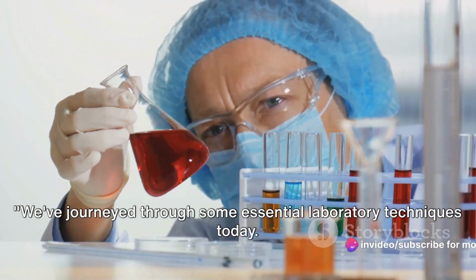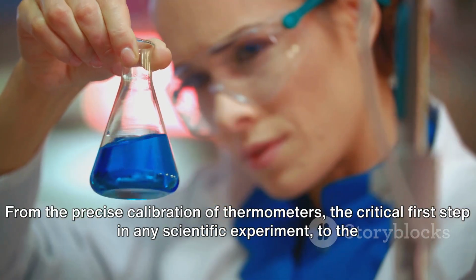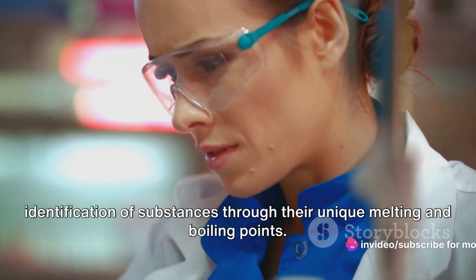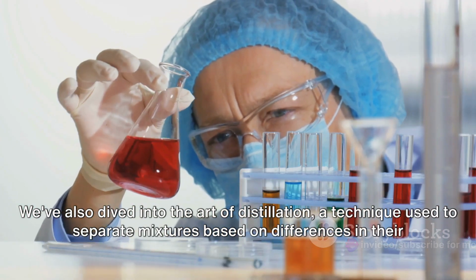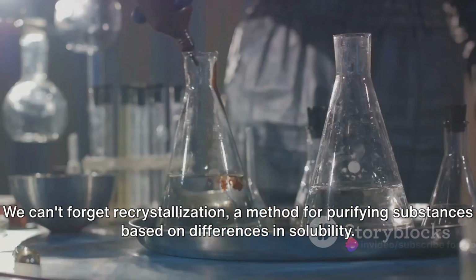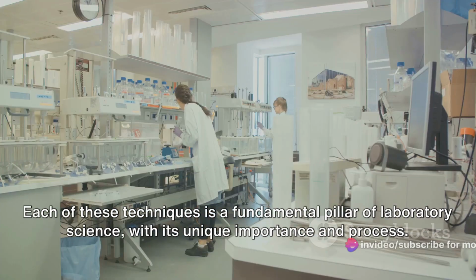We've journeyed through some essential laboratory techniques today. From the precise calibration of thermometers, the critical first step in any scientific experiment, to the identification of substances through their unique melting and boiling points. We've also dived into the art of distillation, a technique used to separate mixtures based on differences in their volatilities in a boiling liquid mixture. We can't forget recrystallization, a method for purifying substances based on differences in solubility.